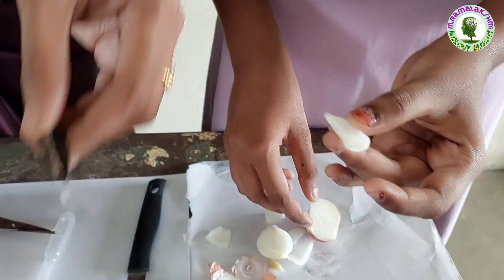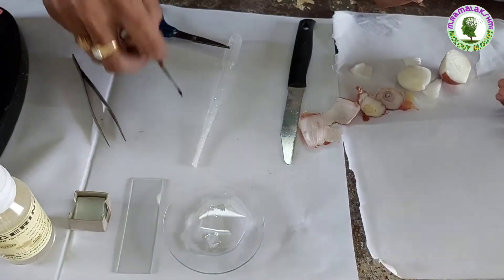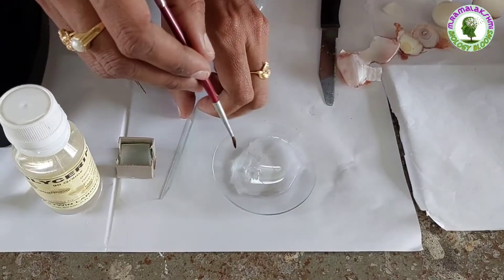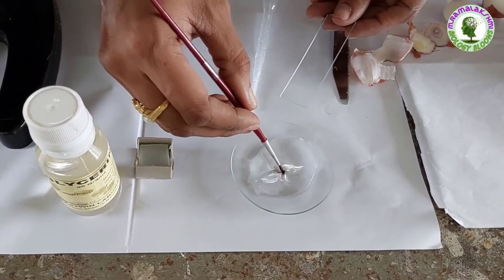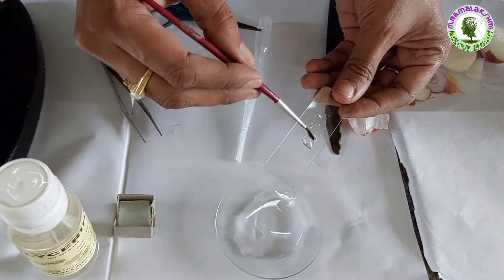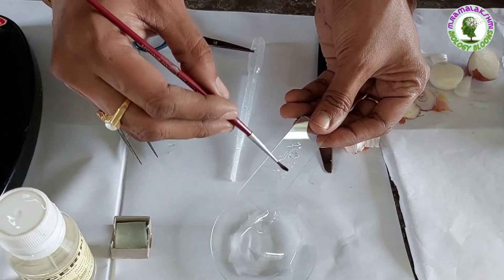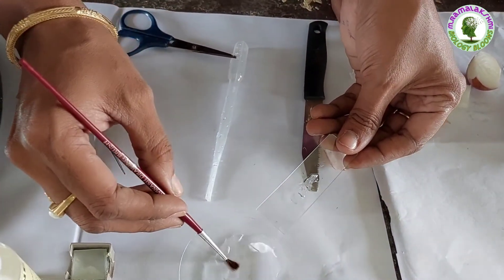Now put it in the watch glass containing water. Then put this peel on the slide, making sure that the peel is flat without folding. Now put a drop of water on it.